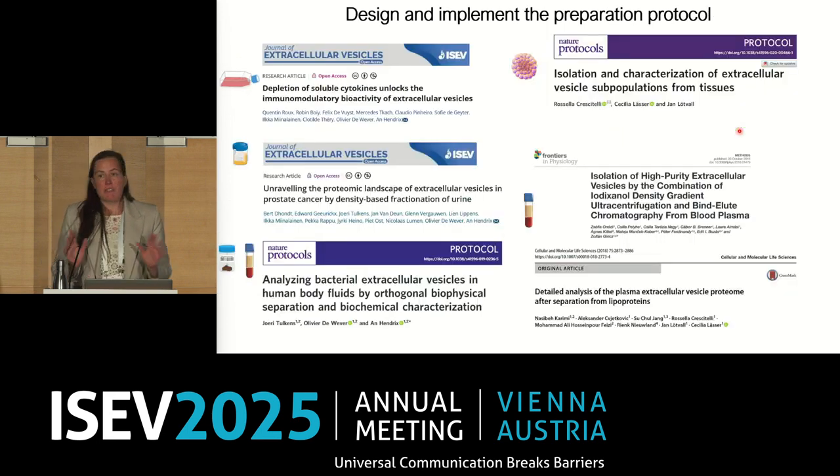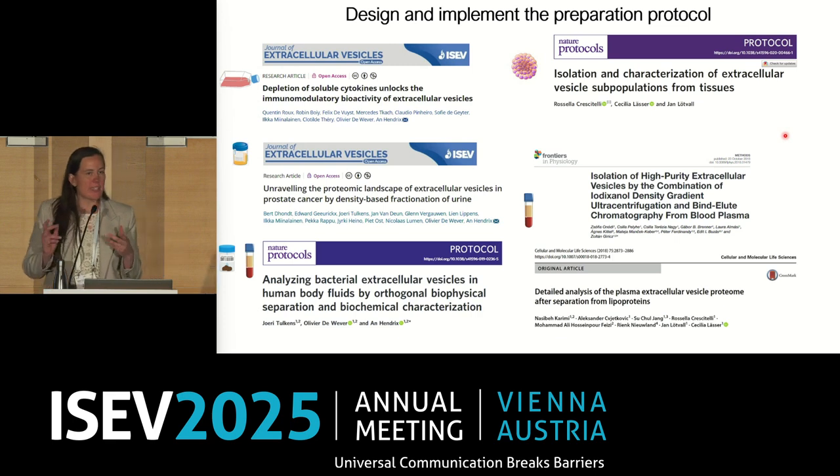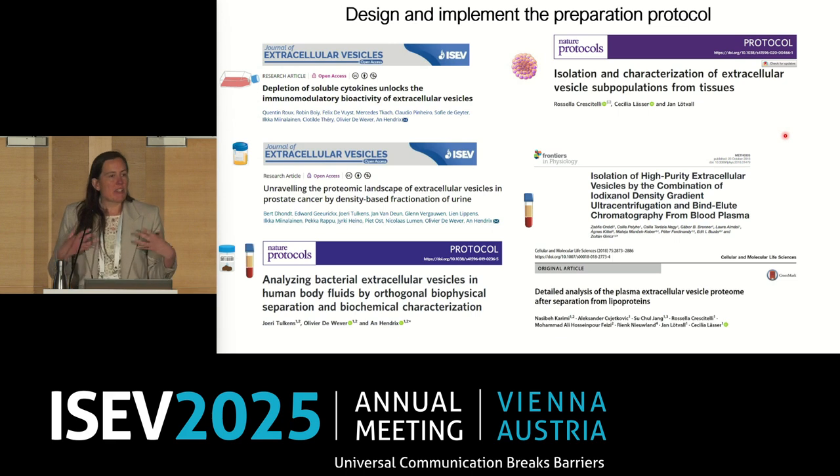Now, there are different types of protocols. We have established our protocols in the lab. There are other research groups that use more or less similar setups, but publish different protocols. And there is not one way good to move forward. It really depends on what the aim of the study is and what you want to achieve with the downstream analysis. It's just important to be aware that these factors can really affect the downstream analysis.